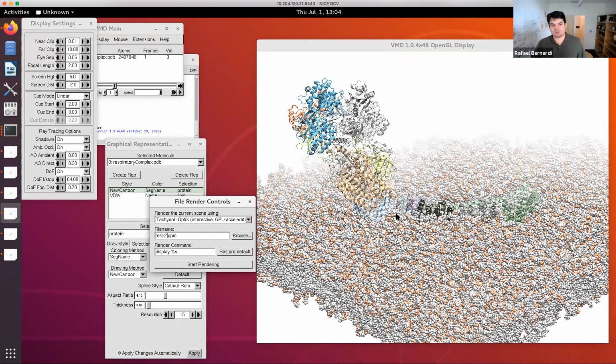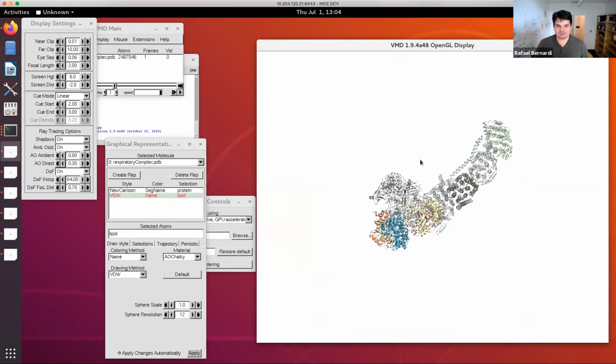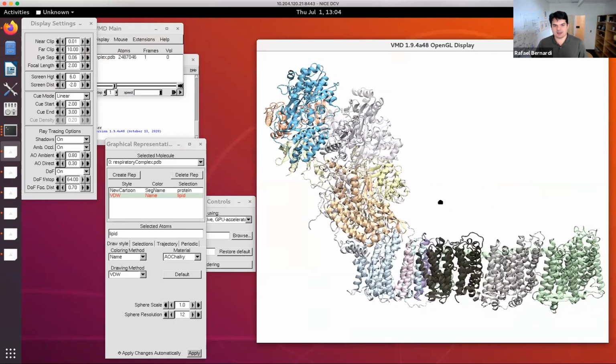Yeah. So this is one of the cases. What else can we turn on and off here? Let's see. You might show them some shiny chrome materials which have reflections. So let's now show just the protein, and let's imagine that instead of having this look on the protein, I want to make it shine.